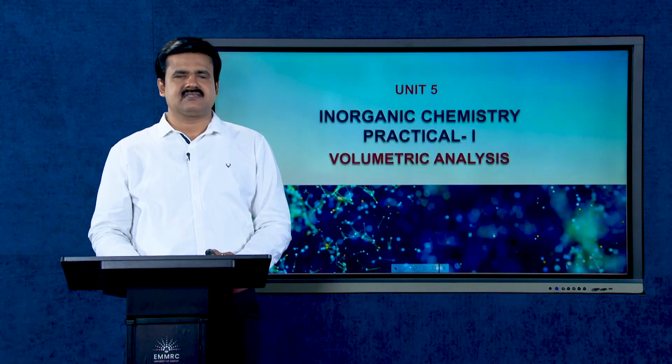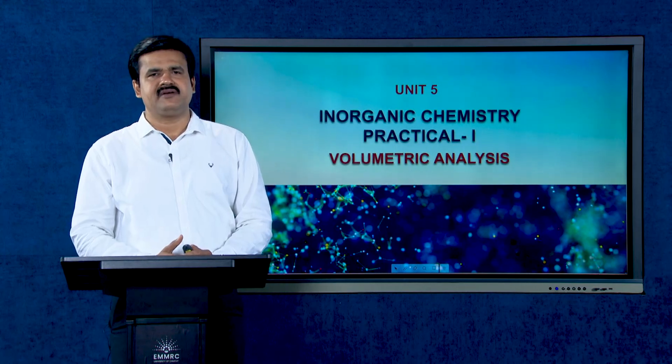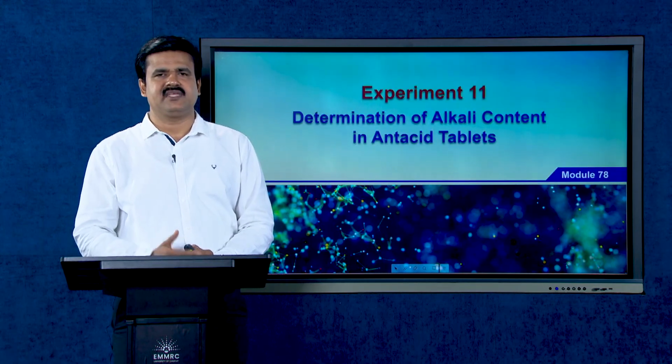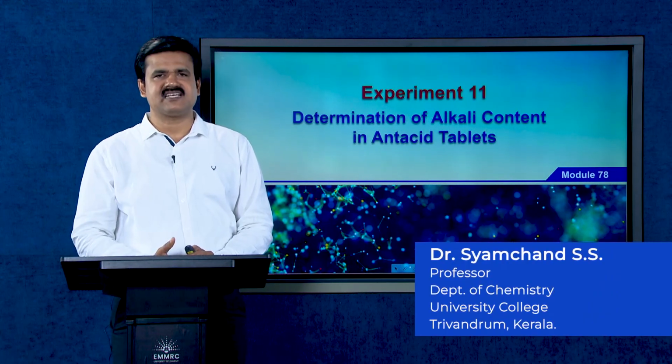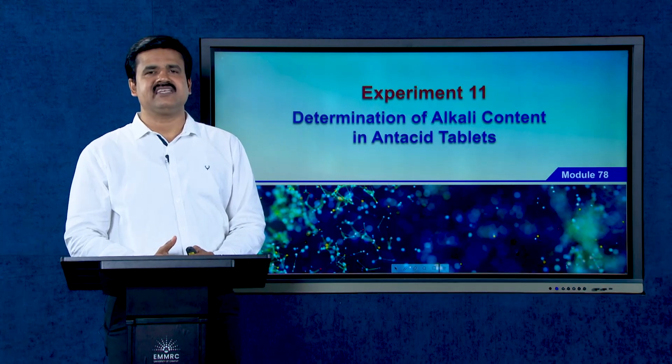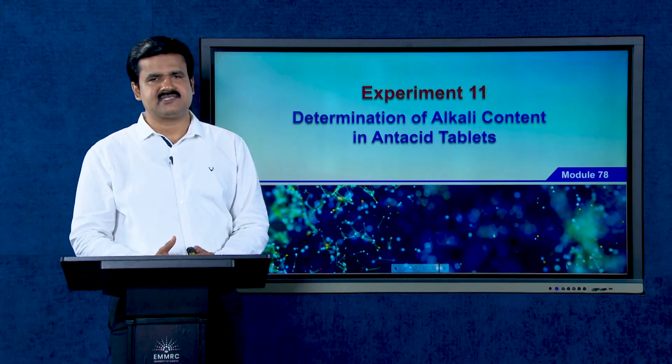Welcome dear learners. We are continuing Unit 5 Inorganic Chemistry Practical 1 Volumetric Analysis. In the present module, we are discussing experiment number 11, determination of alkali content in antacid tablets.